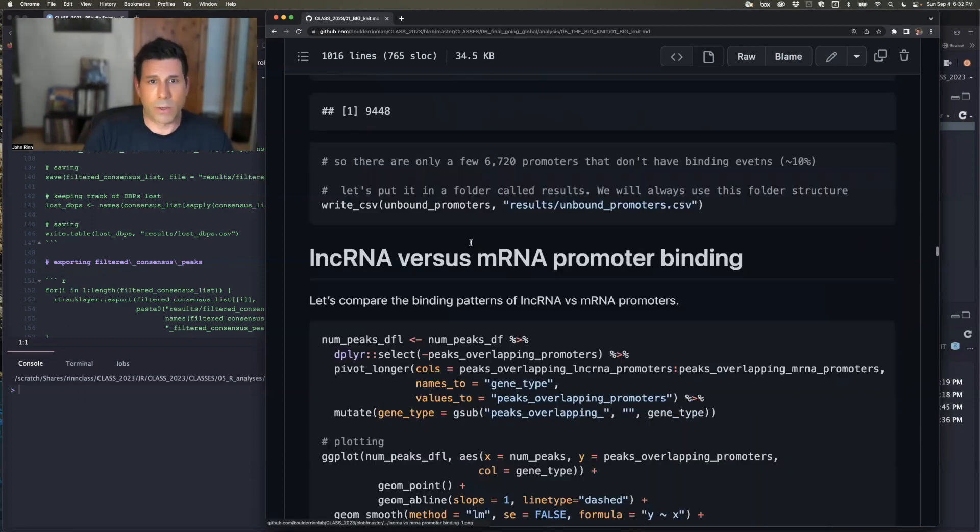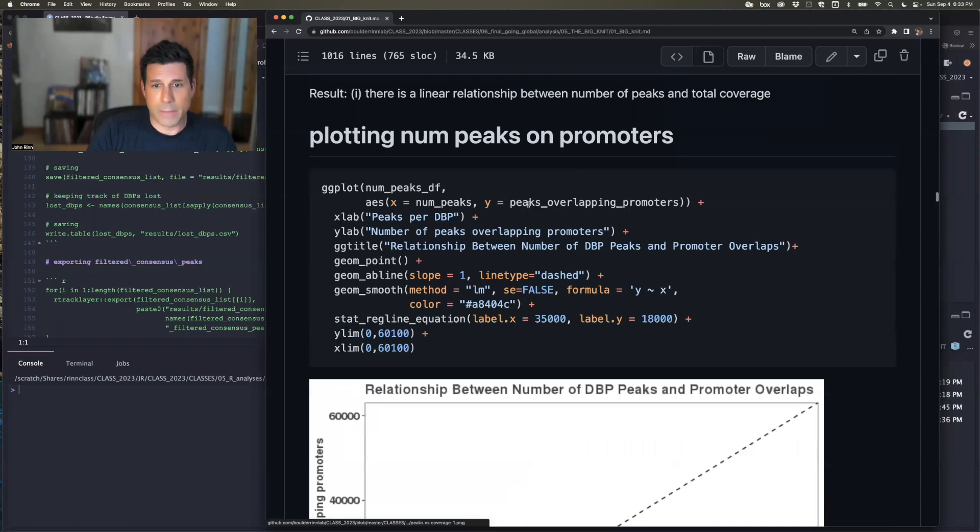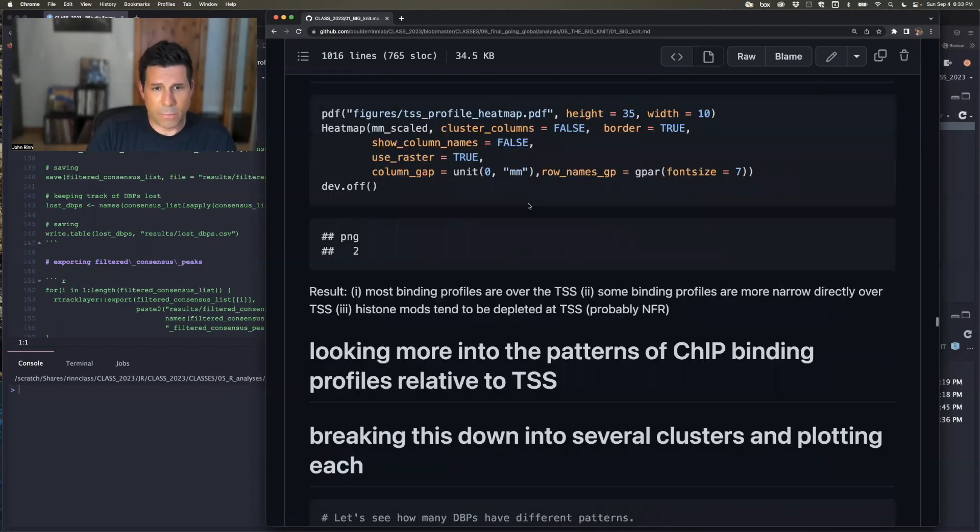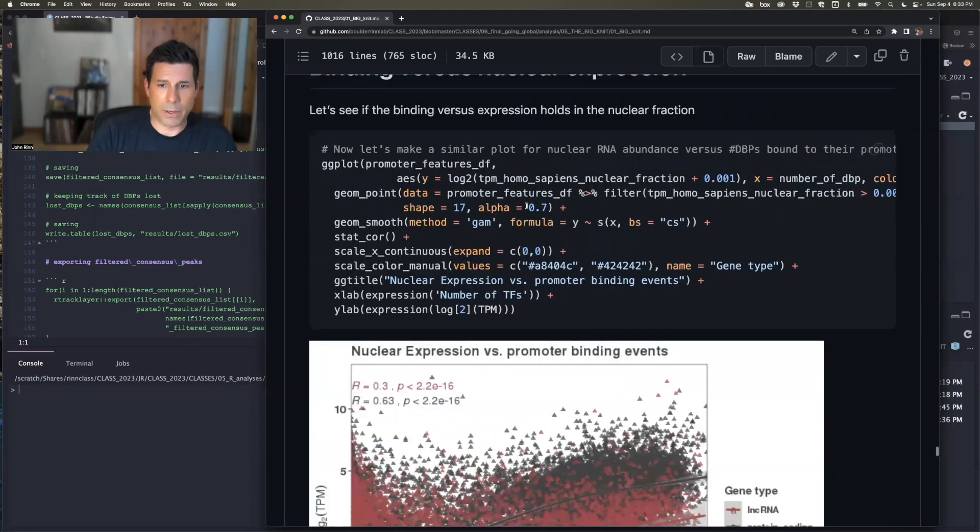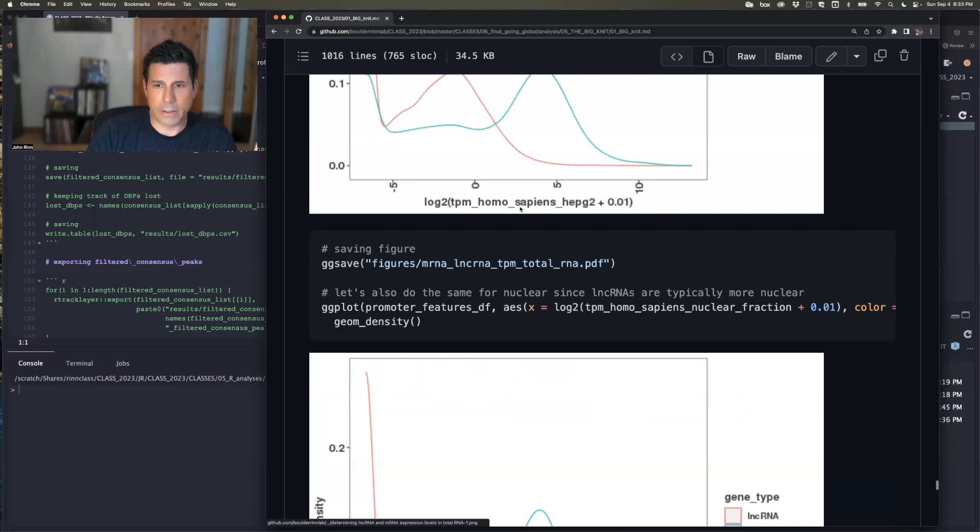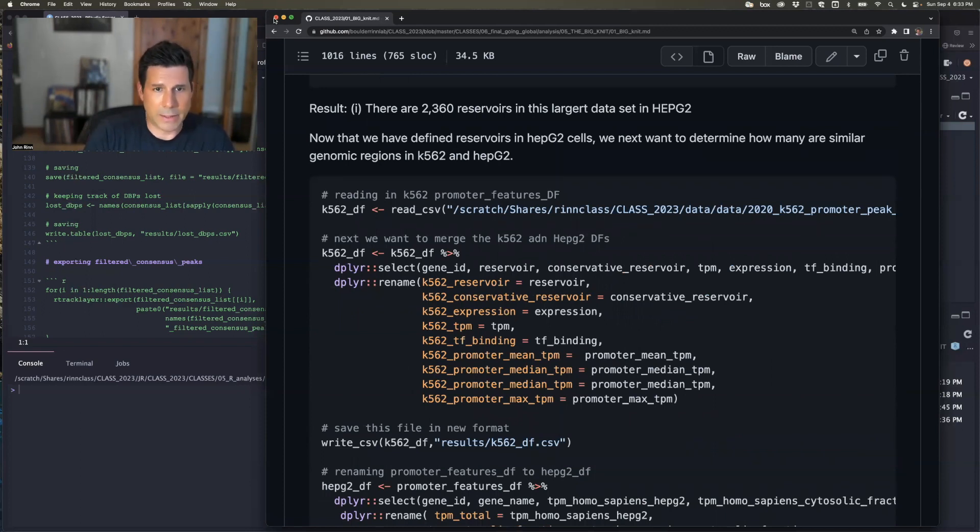So this is, again, you can press one button, run all of this code, and you will reproduce this exact same document. So those are other skills we'll do along the way - how do you write in a way that's reproducible? And then how do you mark it down at the end to produce one of these websites where all of your data is here? So you can have any paper that you published completely reproducible with all the figures right here and the code that produced them. I'm getting into RNA-seq here and comparing long non-coding RNA and mRNA. We're going to do it all. All the basic stuff that we would do on a routine basis, process and do it in a stepwise manner where you reapply these skills over and over again towards interesting questions. And then ultimately we'll feel empowered to work on it with your own data.